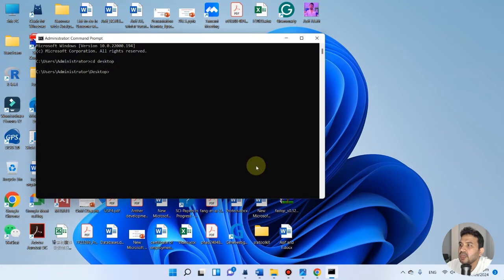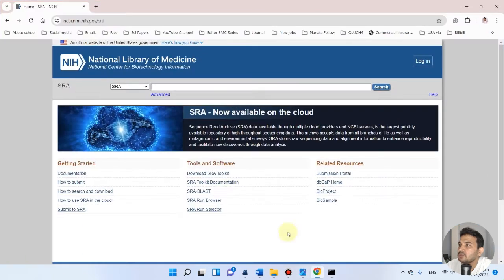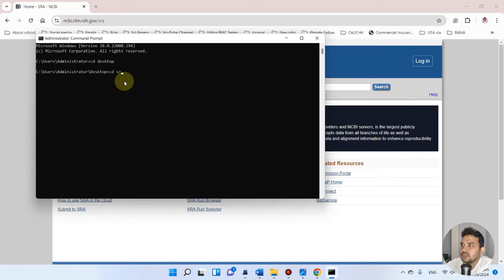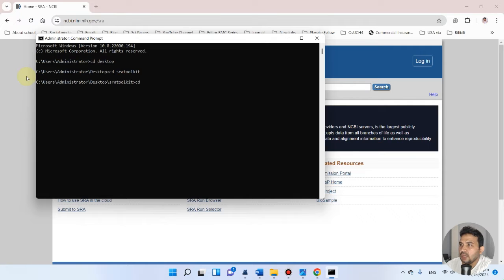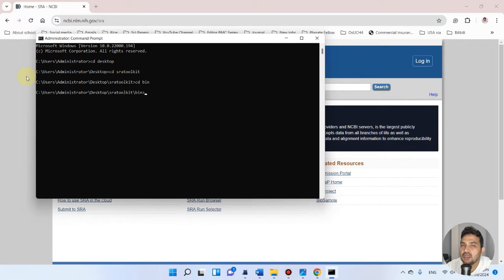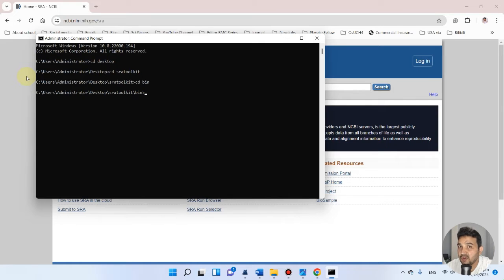That's why I'm changing its directory to Desktop, then changing directory to that folder on the desktop, which is SRA Toolkit. Now we can change directory to the bin folder. In this bin folder, we used fastq-dump file for any SRA accession.